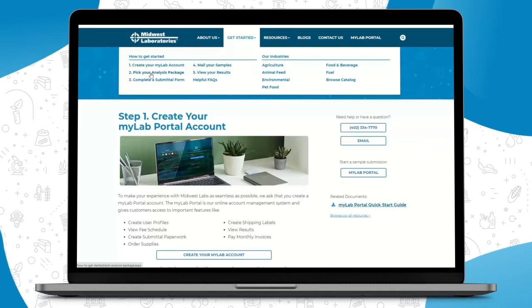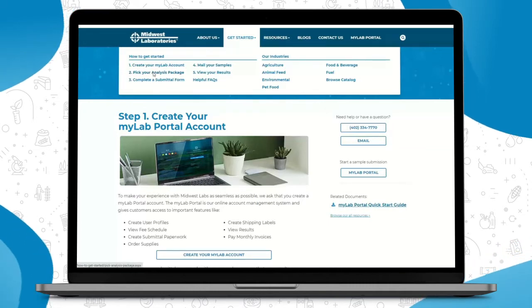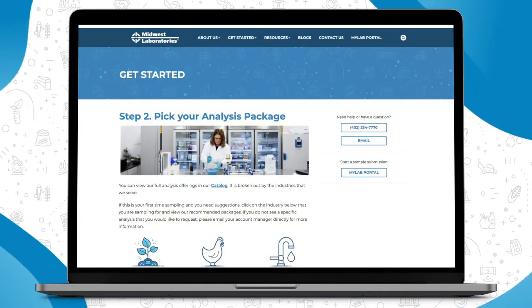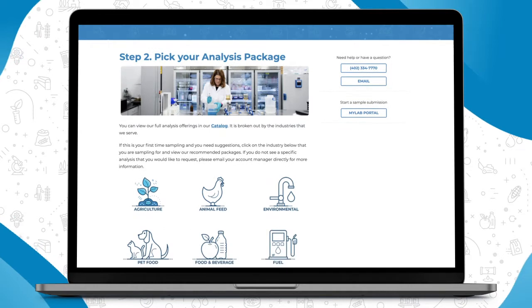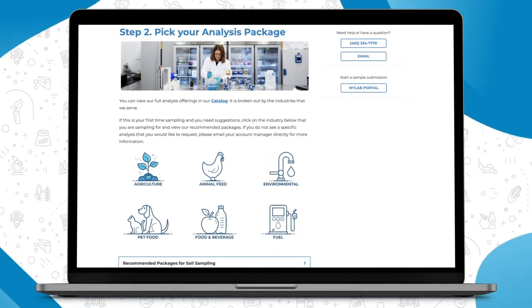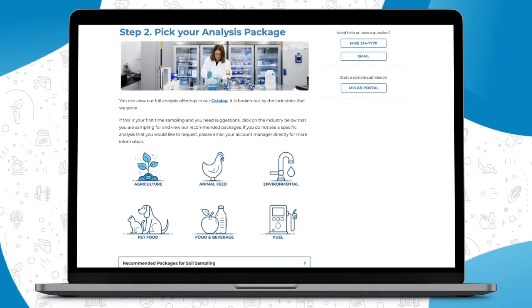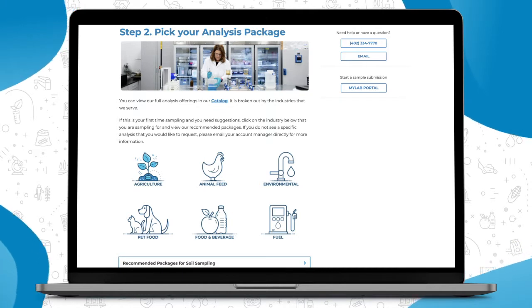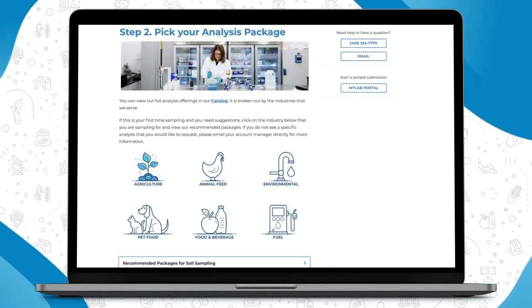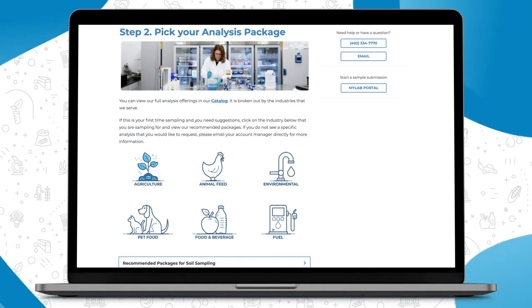The second step of Get Started is picking your analysis package. Here we've included a breakdown by industry, our full pricing catalog. So if you click on agriculture, animal feed, environmental, pet food, food and beverage, or fuel, you can view our full catalog of pricing.